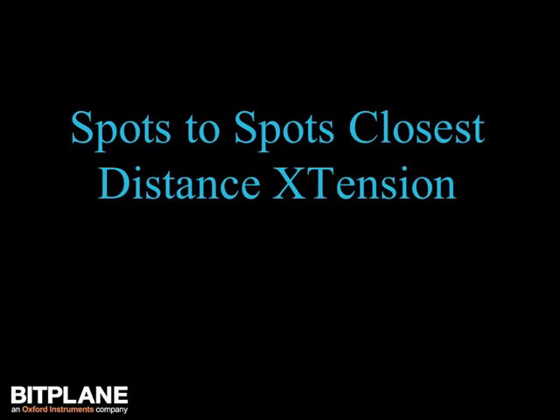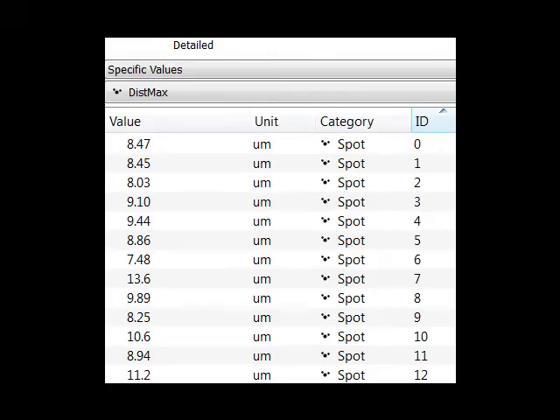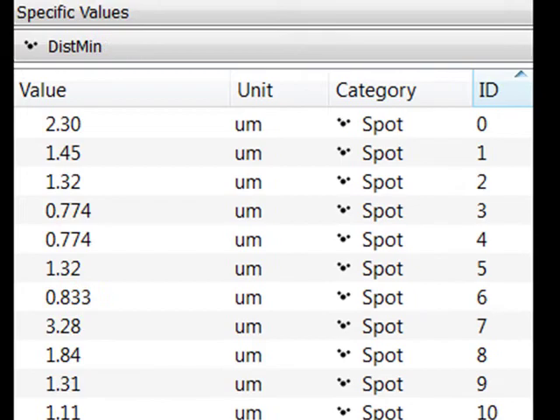This tutorial introduces the Spots-to-Spots Closest Distance extension. This extension calculates and displays the distance to the closest neighbour of the Spots objects.